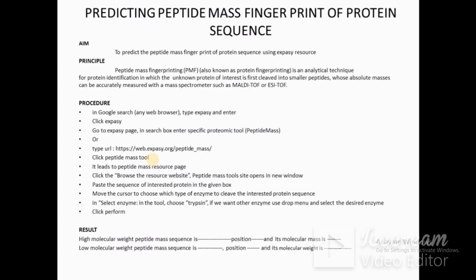From this we can find out how many peptides are cleaved, and which peptide has a high molecular weight or which peptide has a low molecular weight. This will be seen in the peptide mass fingerprint.